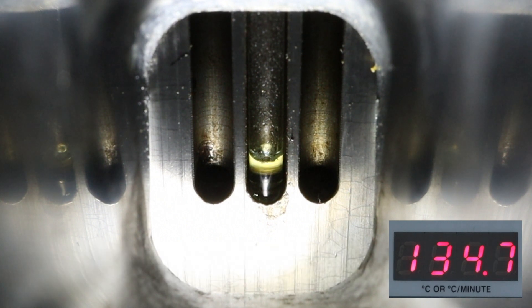At this point you can stop the apparatus and dispose of the capillary tube in a crock designated for glass only.